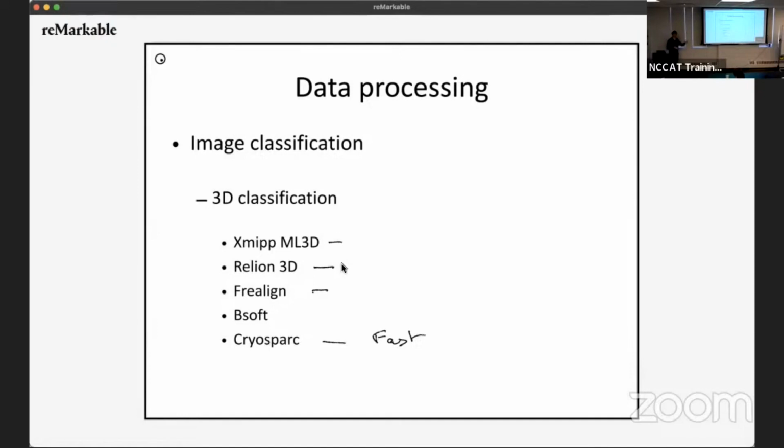A ribosome, a V1-ATPase, things that have different shapes, and then you say, okay, my 500,000 particles, who goes to reference 1 and who does not? And that way you can sort out very quickly in 3D without losing your rare views. You can sort out the junk from the good stuff. Just do 2 or 3 rounds of that, and you end up with a very clean data set.